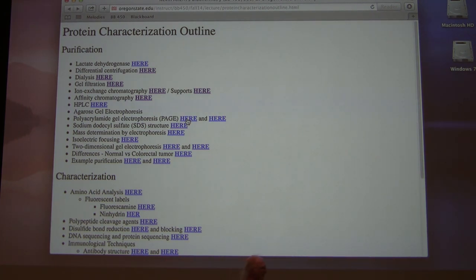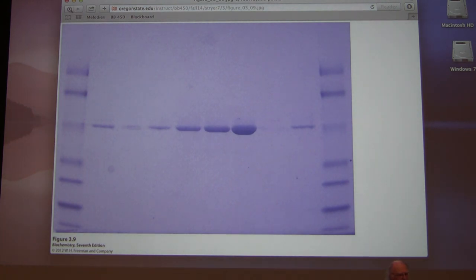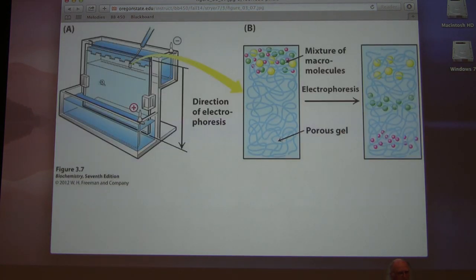No. Okay. So polyacrylamide gel electrophoresis is one type of gel electrophoresis, and it's the less common of the two. If you've worked in a DNA lab, you've probably done agarose gel electrophoresis. How many people know the difference between those two? Okay, so I'm going to show you an example of agarose to start with, because agarose gel electrophoresis, that's actually polyacrylamide gel electrophoresis, that is too.